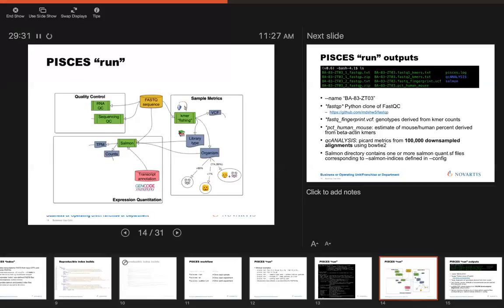And the question from the other side, do you think it is possible to use k-mers to detect allelic bias? Like, can you try it on imprinted genes? From RNA-seq data, I think you would have to have the DNA-seq as well, because to say there's allelic bias, you have to know that there are alleles. Yeah, it's problematic to do SNP calling from RNA-seq data.